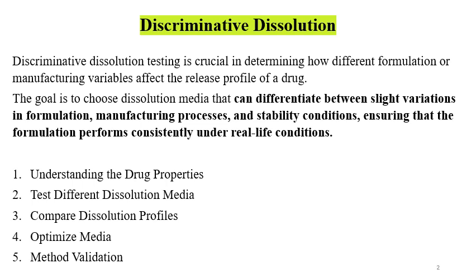First of all, we should know what is discriminatory dissolution method, what is discriminatory power. So, the dissolution method and the parameters and the specifications which give you understanding about the different formulations which may not be good or which may not be bioequivalent. Discriminative dissolution testing is important and crucial in determining how different formulations or manufacturing variables affect the release profile of the drug.